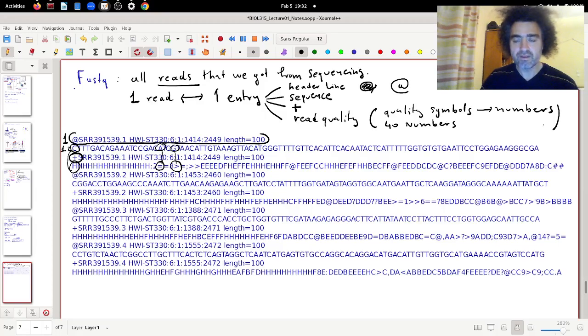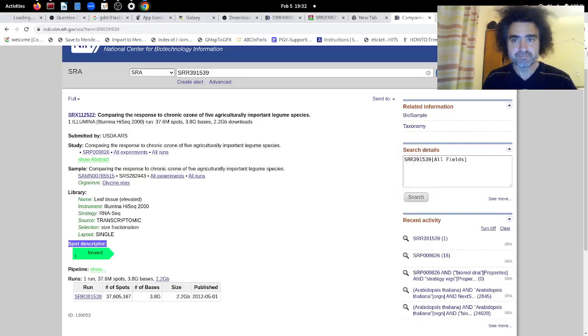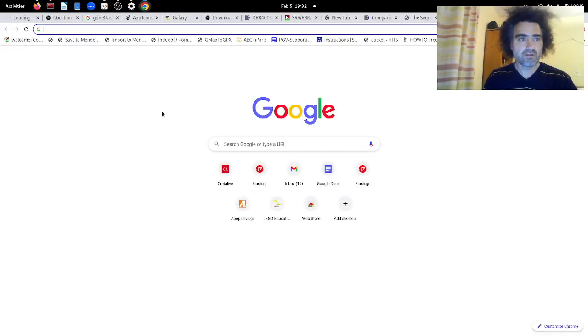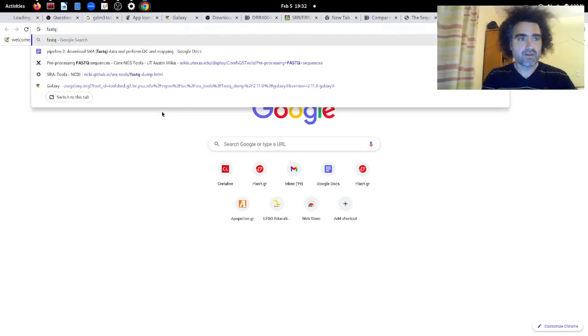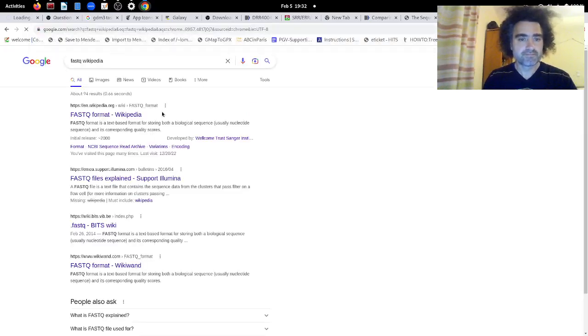Okay, let's see what they are actually. I go back to Google here. I just type fastq Wikipedia. I go here to the fastq format.